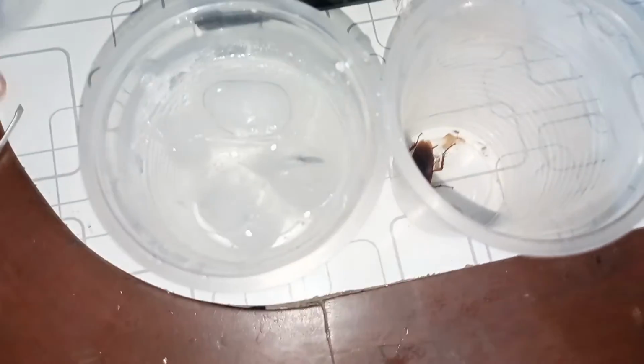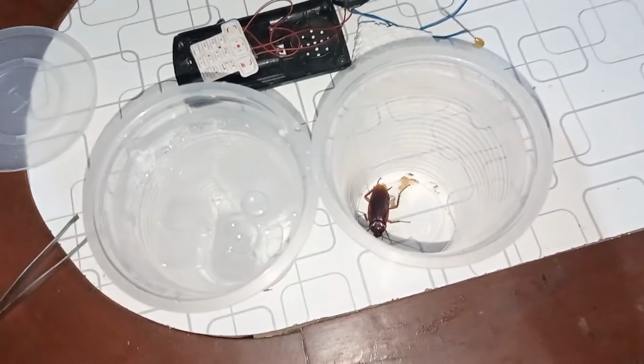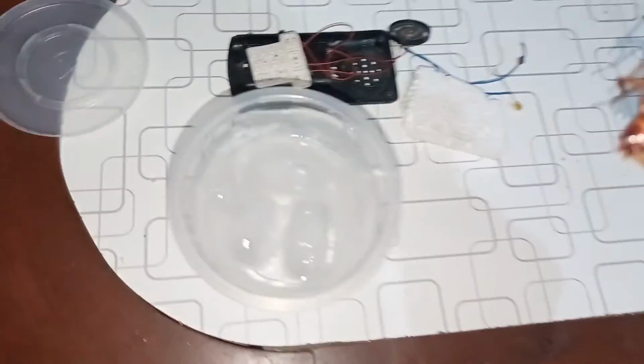We have this ice water. As you can see, this is our ice water. I dip my cockroach in the ice water so that it goes into an anesthetic condition. So let me put the cockroach in the ice water.